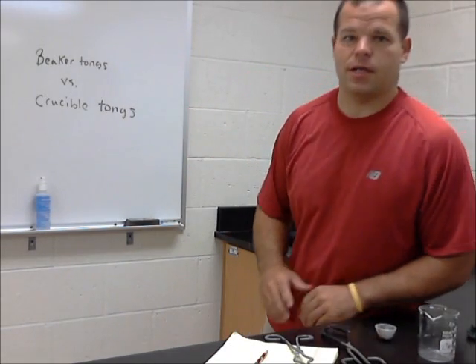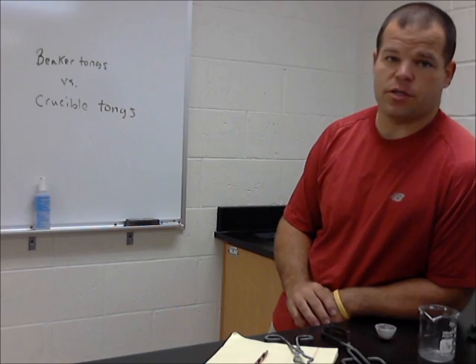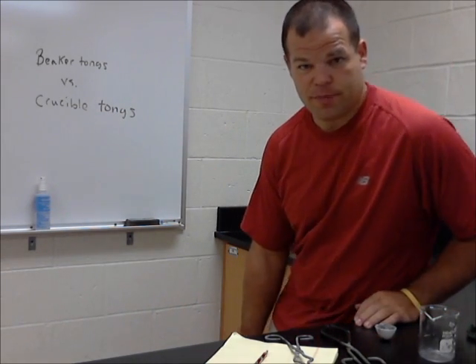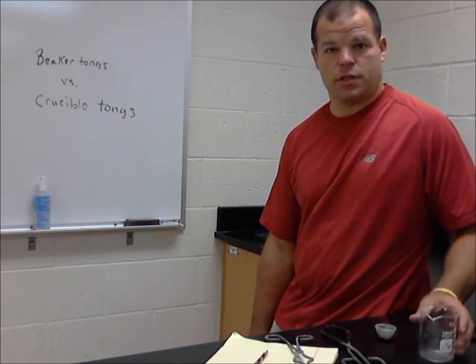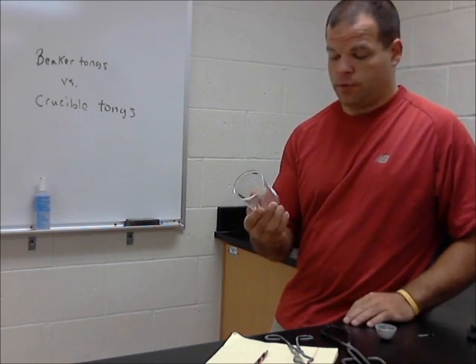My name is Mr. Schweitzer, and I'm here today to give you a little bit of information about beaker tongs and crucible tongs. First of all, a couple of things before we get started on the beaker tongs: what's a beaker? Well, this is a beaker.